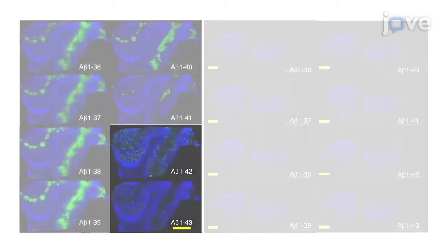By contrast, shorter amyloid betas such as amyloid beta 1 to 36 to 1 to 41 were preferentially deposited on the leptomeningeal vascular areas.